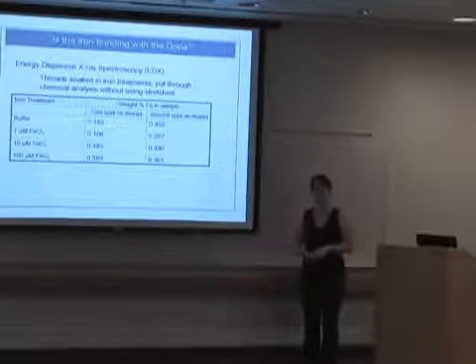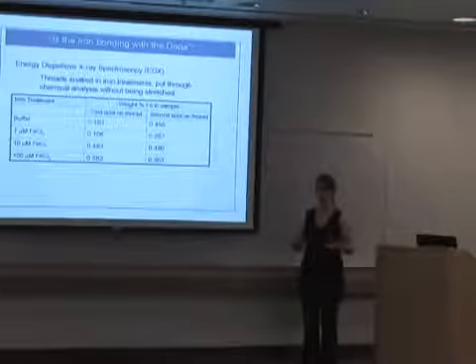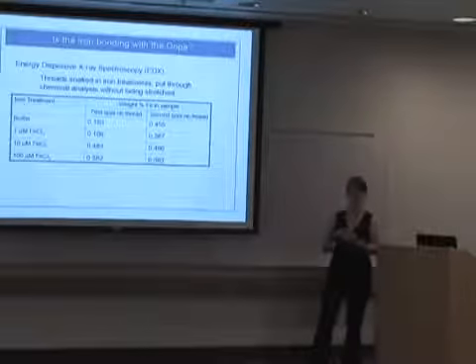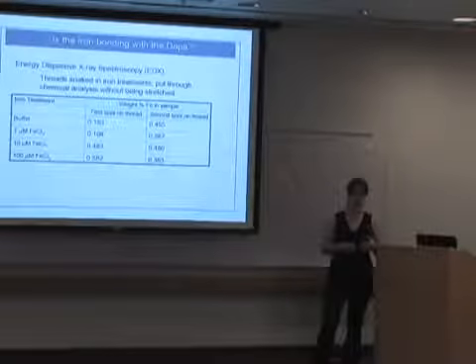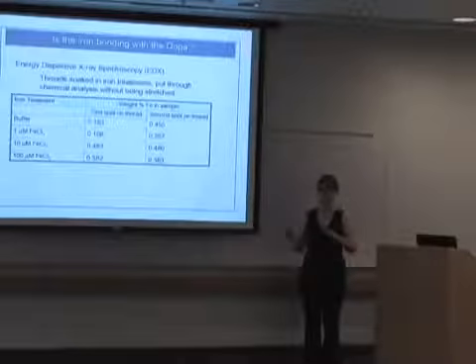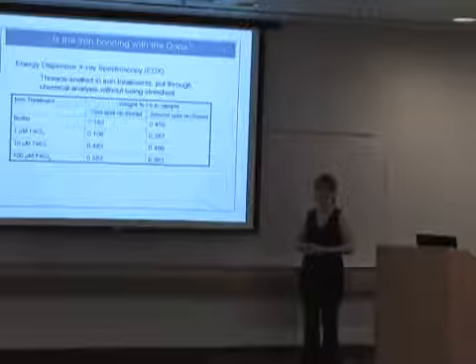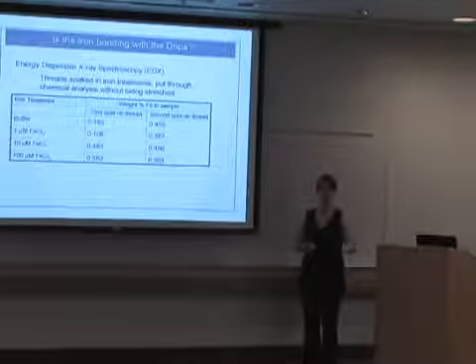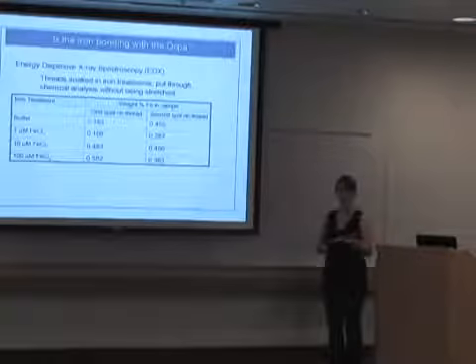So due to all the variation in my data, I wanted to go back and make sure that the chemistry that I was assuming was happening actually was happening in my solutions. Namely that the controlling of the pH was enough to ensure that the iron was bonding with DOPA in the threads. So I took a sample of threads and I put them through the exact same protocol that all the other samples had been through, except I didn't stretch them. Instead, I used energy dispersive X-ray spectroscopy to chemically analyze what elements were present in the thread. And so I was specifically looking for iron.